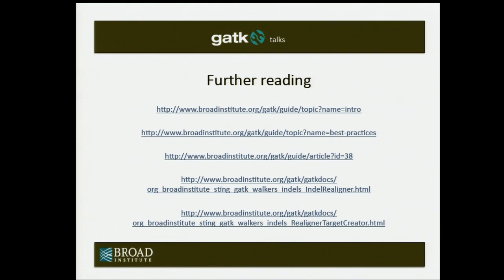What's the maximum size of the indel? So theoretically, there is no maximum size of the indel. The Smith-Waterman can work on any size. You're capped by the size of the indels in your known catalog of variants. In dbSNP, there aren't that many large indels. So that's one cap. The other thing is indels already seen in the original alignments from BWA.